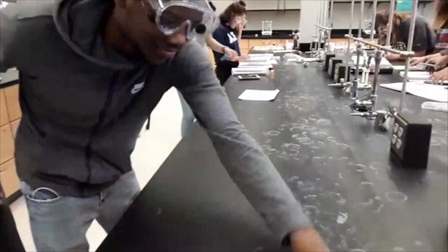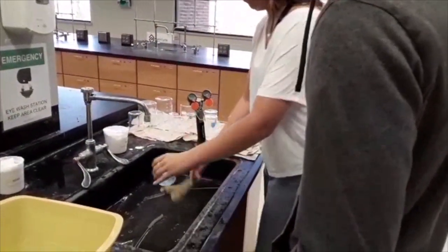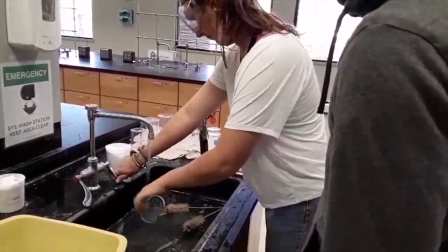After finishing the lab, wipe up any excess solution that was on the work table and clean all your beakers, volumetric flasks, and pipette properly.